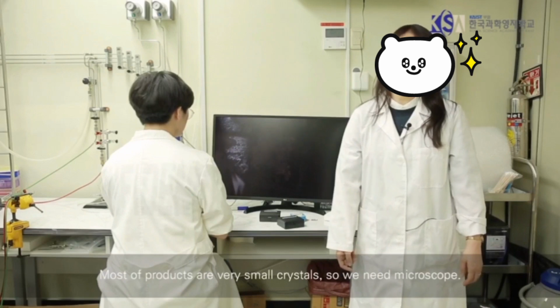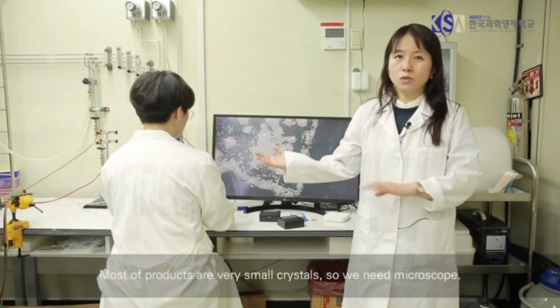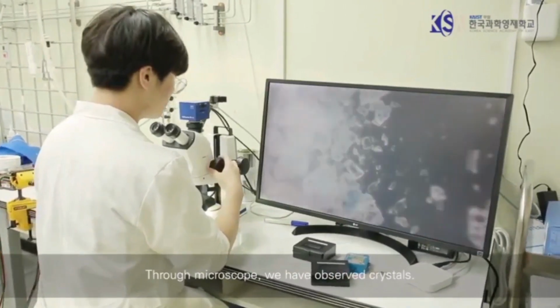Most of the products are very small crystals of 0.1 millimeter. So we need a microscope. Through the microscope, we have to observe the crystal.